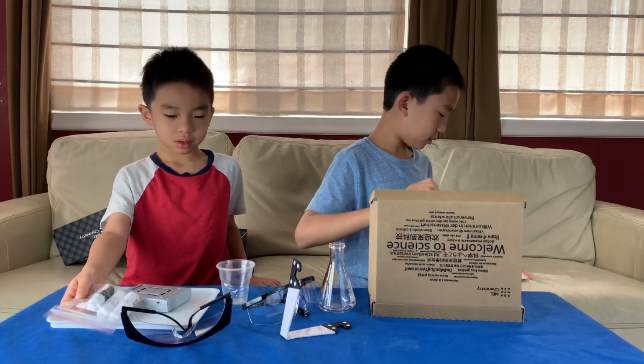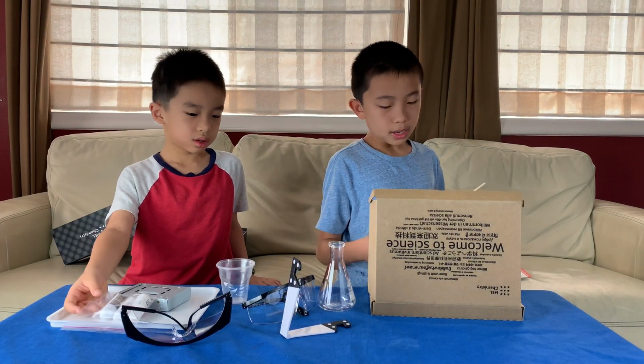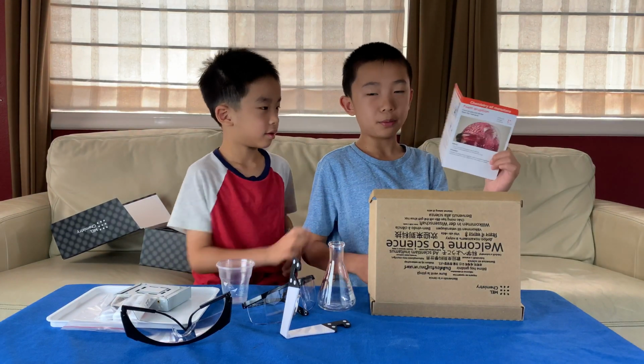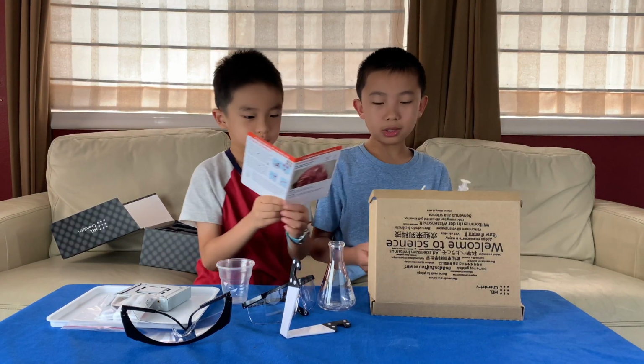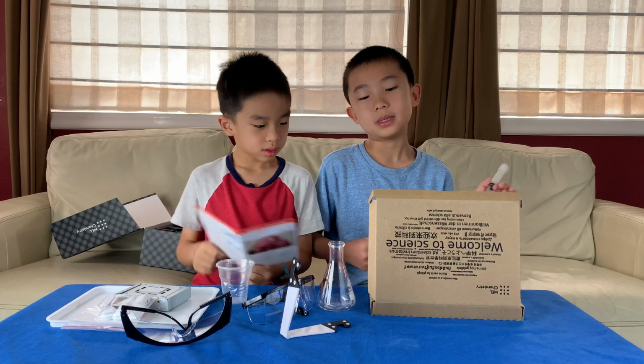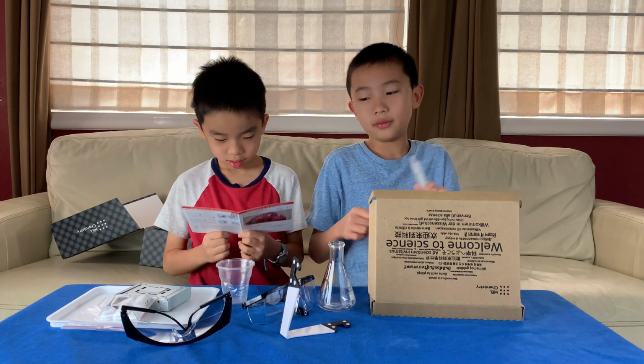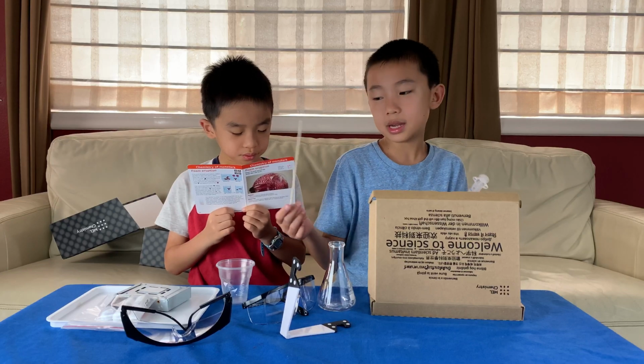Right now we're getting everything that we'll need for the foam eruption. The reason we're doing the foam eruption first is because it takes less time, and also the danger level is less. So it'll give us kind of a warm up.